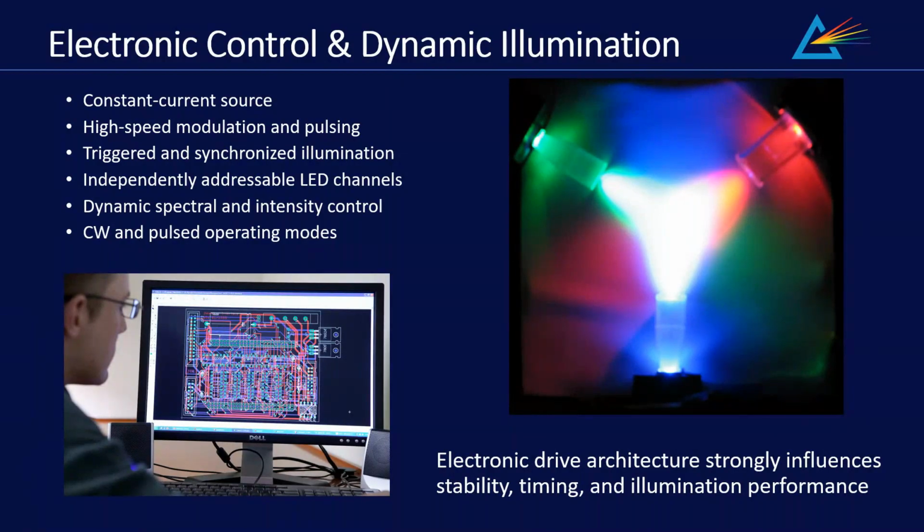Pulse width and duty cycle then become important engineering considerations because junction heating ultimately affects optical stability, efficiency, and long-term reliability and lifetime. In multi-die architectures, independently addressable channels allow different wavelength groups to operate independently, supporting programmable illumination sequences and adaptive spectral control. These capabilities are particularly valuable in applications such as fluorescent imaging, high-speed imaging, PCR, and multimodal biomedical instrumentation, all where timing, precision, and optical consistency are very important.